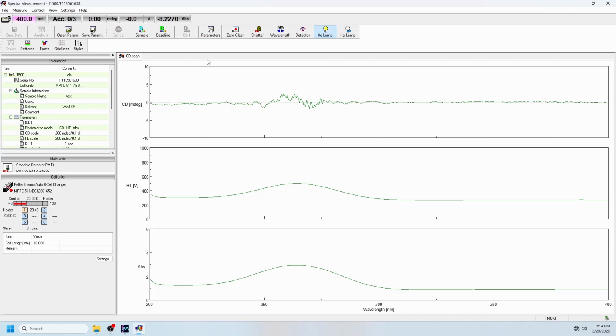The first thing you'll want to do is go to control and then light source. We want to record these 2 numbers into the logbook, the 38 hours and then the 0.8 hours. And then the last number for the logbook is going to be the nitrogen tank, so just go look at the nitrogen tank and make sure you record that value.